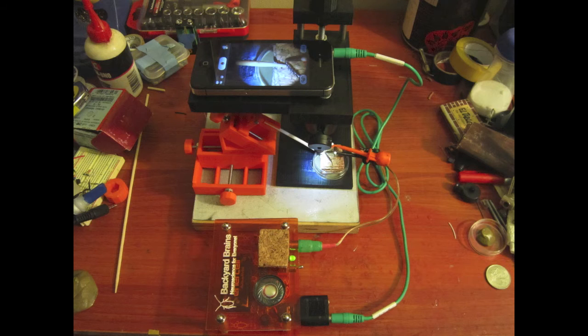But one example is to carefully manipulate the sentry hairs on a cockroach leg in combination with our roach scope and spiker box.